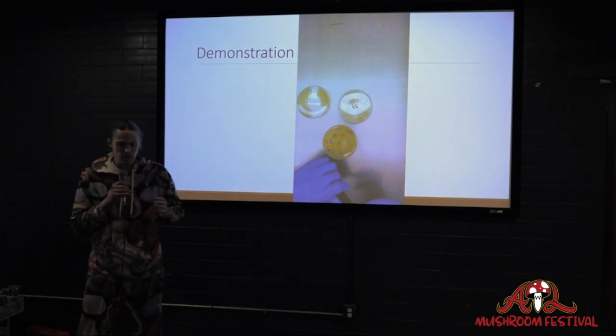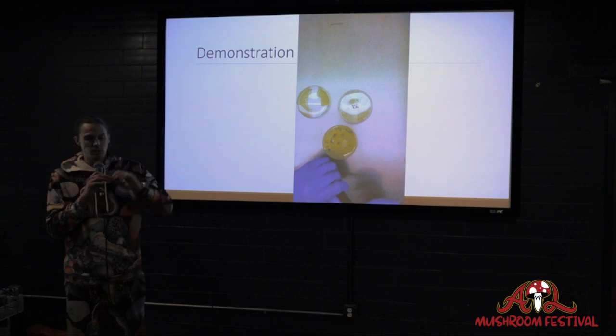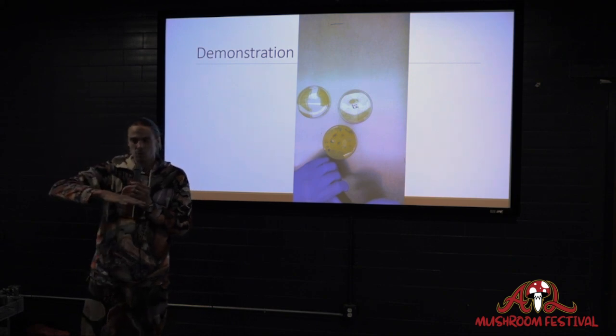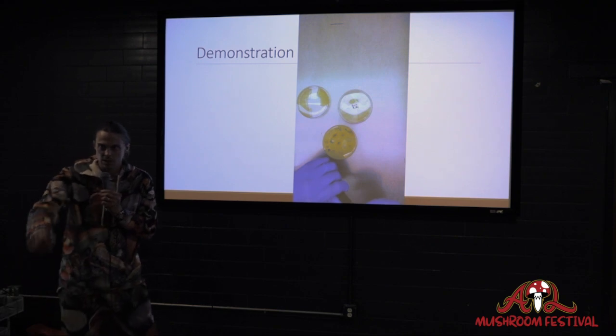So really, the technique is very simple, but the fine tuning is in how well you can take your sample, put it in the hole, and then take that cover slip and cover it without having to touch it or move it any more than what's absolutely necessary. Yes, question?